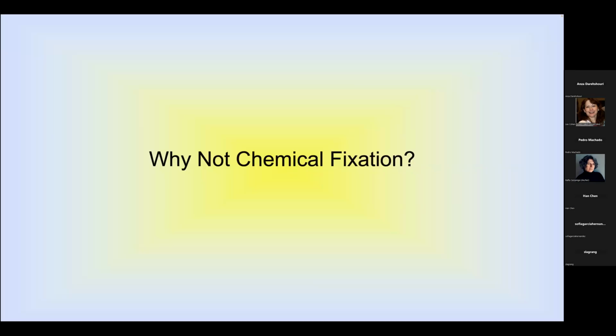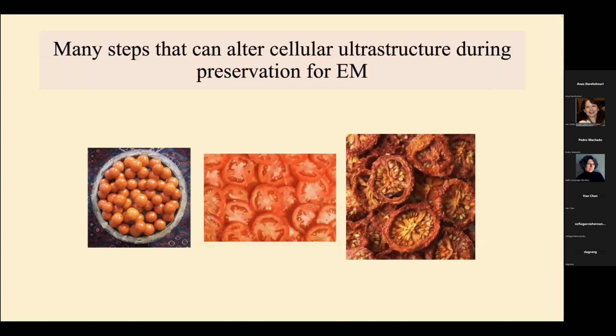And so before we go in, it was mentioned in the last talk that ChemFix is still widely used and maybe the favorite technique. And I think a lot of people shy away from HPF because it sounds difficult, or it could be a little challenging at times. But I kind of want to go through why not chemical fixation, because that's the question I get asked when I present HPF as an alternative. And if you go through this process where you're looking at how to go from the fresh cells to something we study in electron microscope.